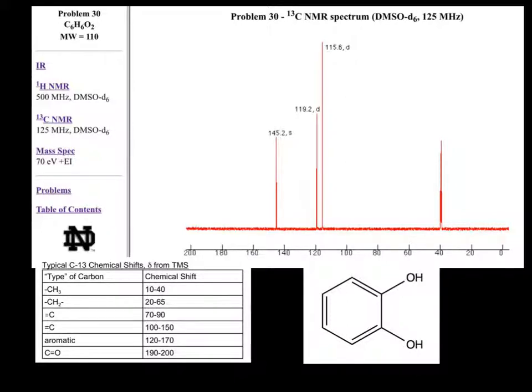So the carbon-13 NMR spectra shown here is going to tell us that we're going to have 3 different carbon groups. Much like proton NMR, the carbon group found furthest downfield is going to experience the most de-shielding, and the carbon group found furthest upfield is going to experience the least de-shielding. When we look at the chemical shift of each carbon group and compare it to the corresponding table, we see that we're going to have CC double bonds, and we're also going to have an aromatic molecule.